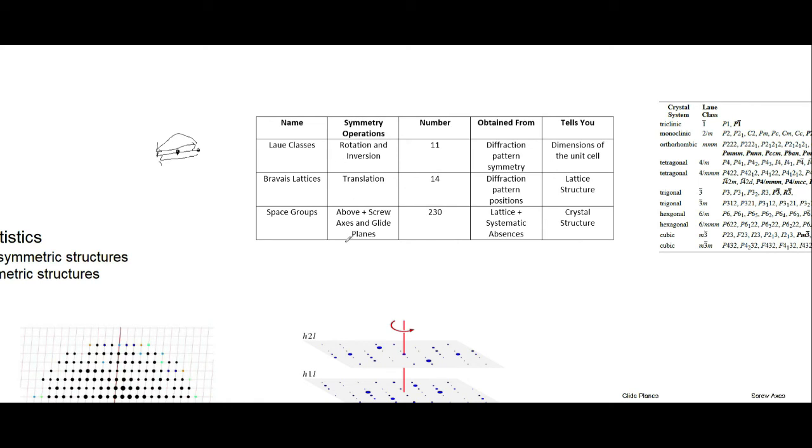But then we also want to know, so if we have something like this, it would also be in a crystal where there is something else in the crystal next to it like that. So this would be a unit cell, but then we could translate that unit cell down here and it would completely overlap with this.